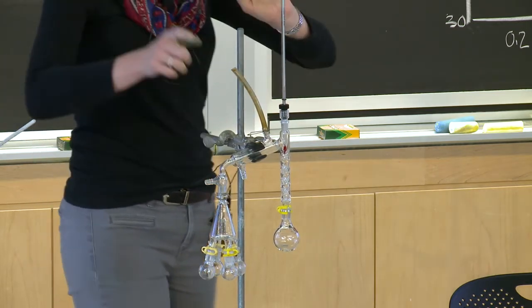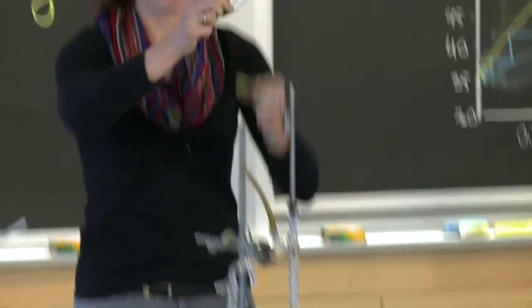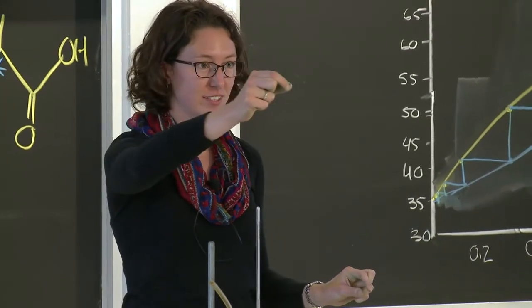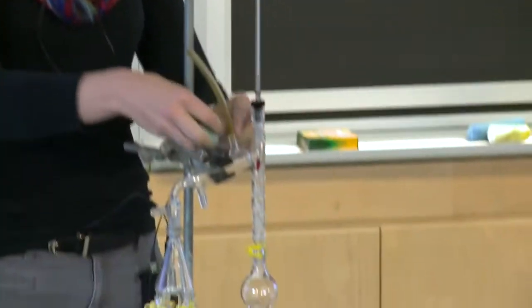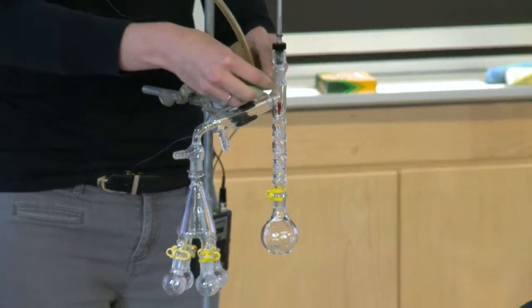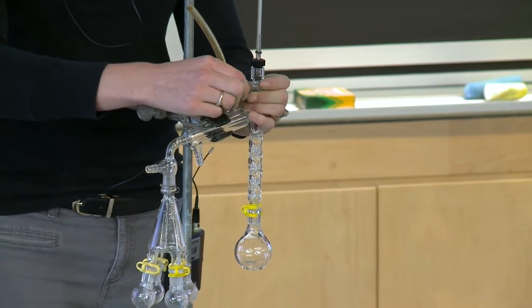And this could be possibly the most important thing I will tell you today. This little metal piece is very important to the success of your lab. Does anyone know what this does? So when you attach your tubing from your water lines, you want to have one of these little metal guys, and it'll wrap around your tubing and your glassware, and then it'll clip together to secure your glassware to your tubing.